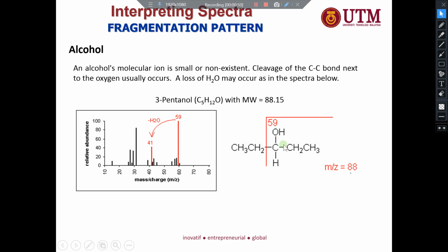Okay, dia akan potong sini atau sini lah. Again, let's say for example here is the primary, and on the other side you have the secondary or tertiary, usually they will cut on the one at the primary lah, sebab dia akan pilih yang lagi stabil.